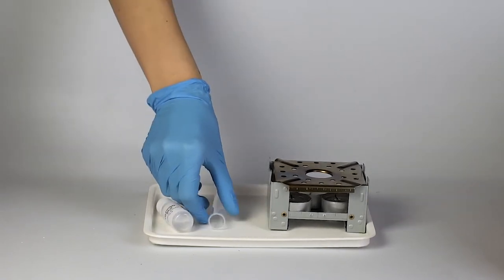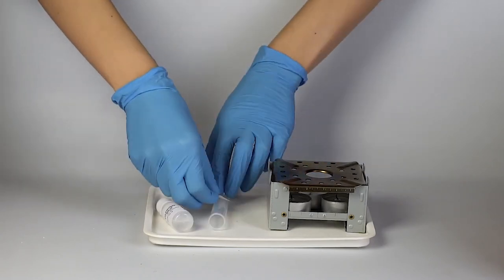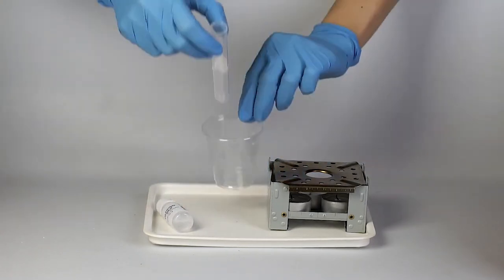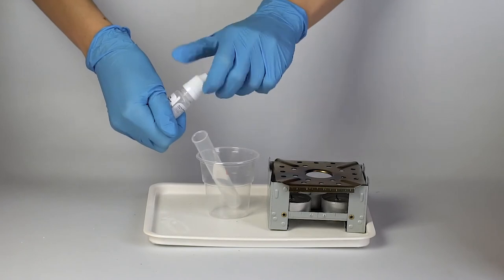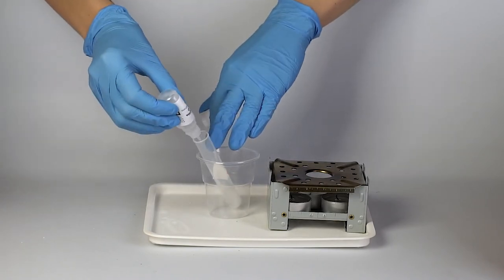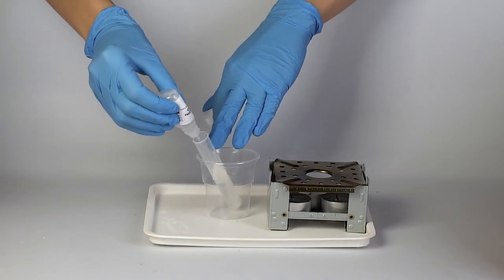Attach a square thermochrome sticker onto the test tube and place it into the disposable cup. Carefully pour all the sodium acetate from the bottle into the test tube.